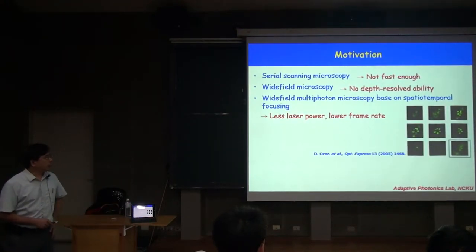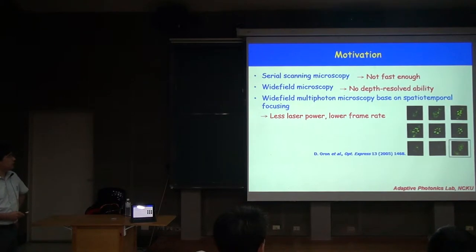So if you base it on temporal focusing, first of all you can get better scanning, not just point by point, it's a wide field. But if you use the conventional wide field excitation, you cannot get the resolution capability.